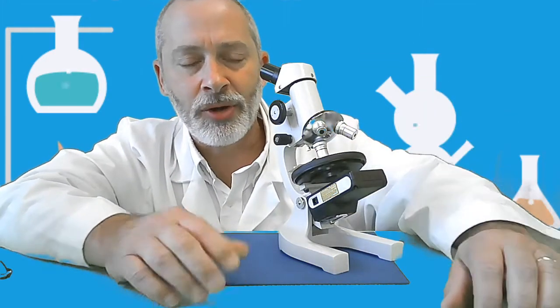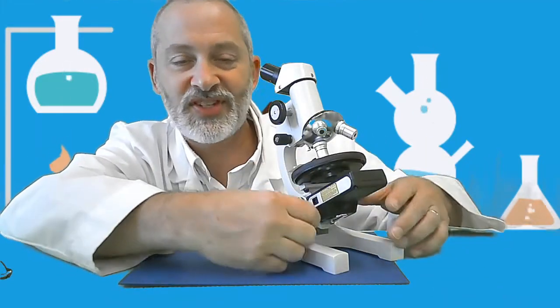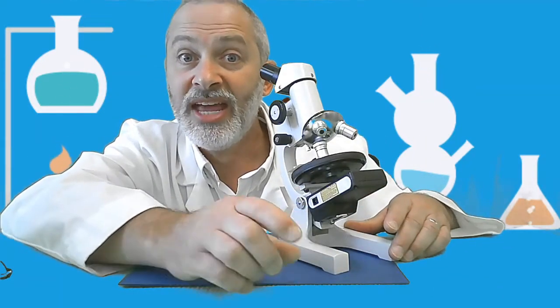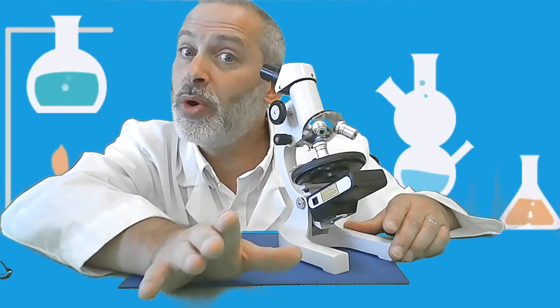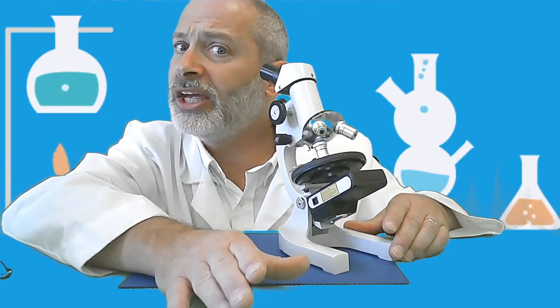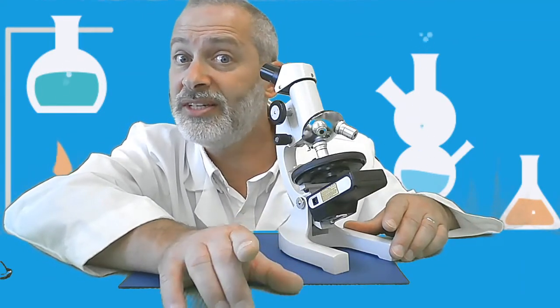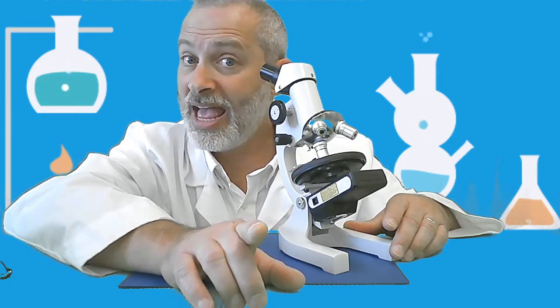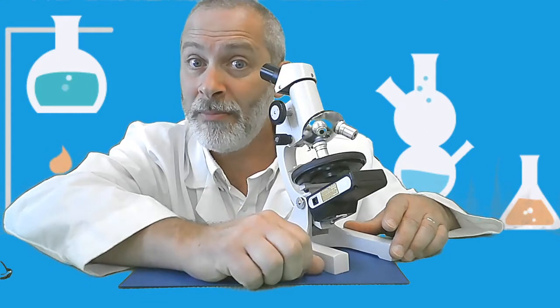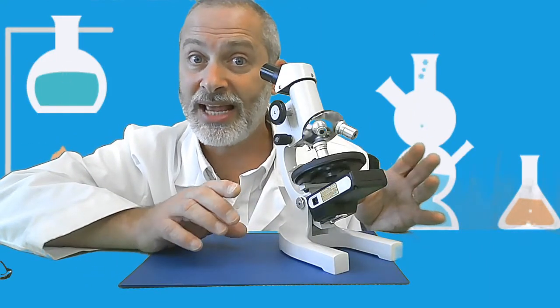Now, in order for us to complete the lab, we're going to have to move the stage around and hunt for cells that are showing us what we think we need to be looking for to tell the difference between a plant cell and an animal cell. But remember, the image is inverted, upside down and backwards.